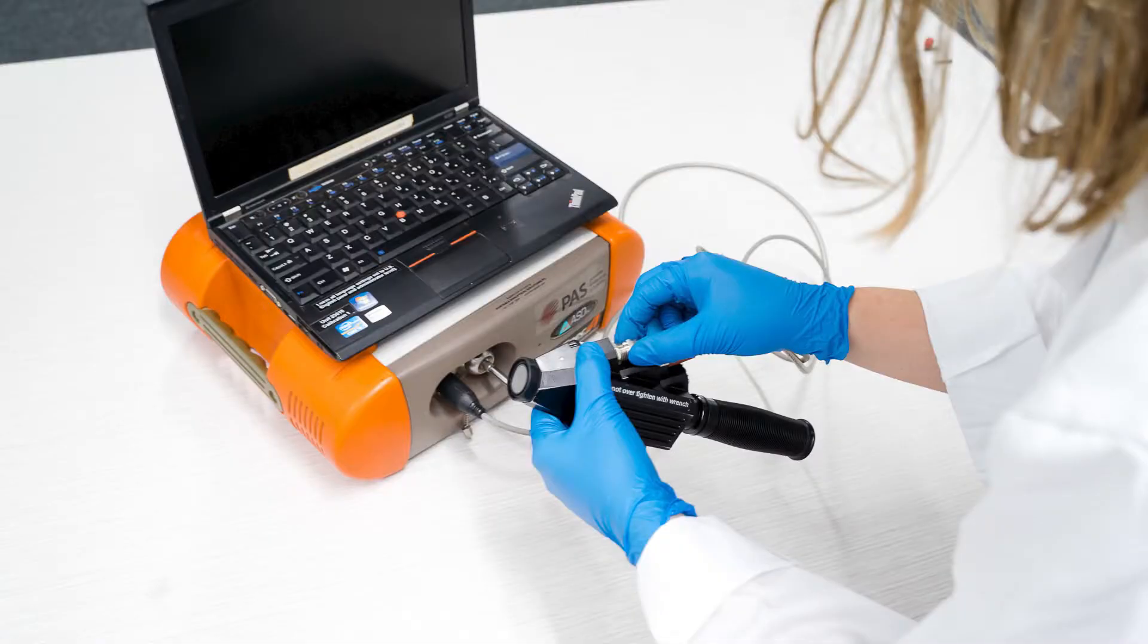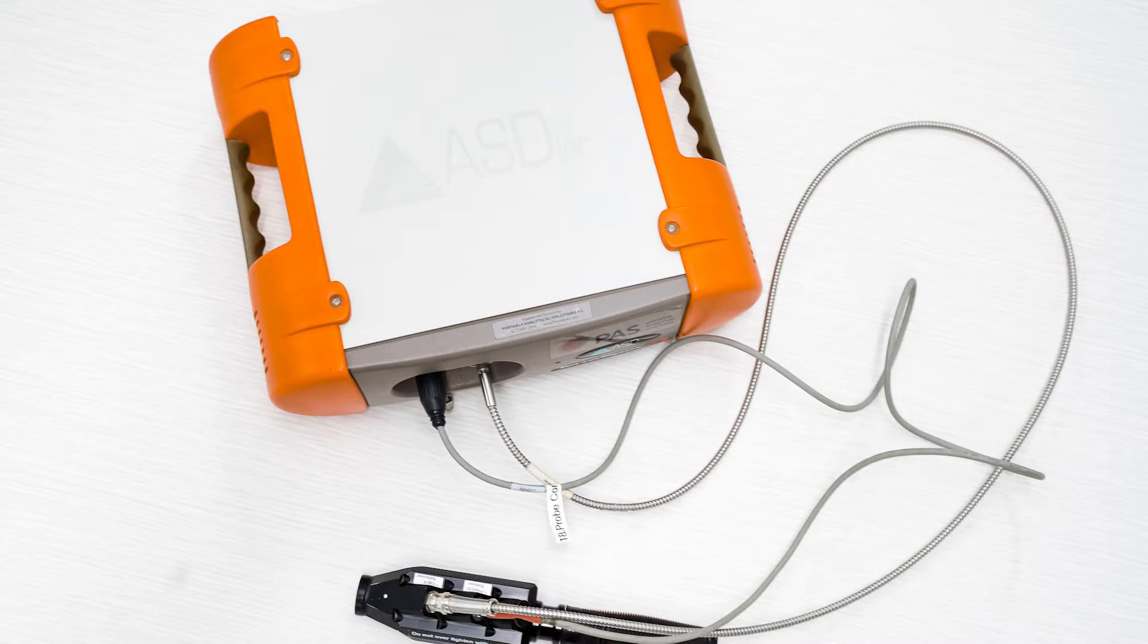Today we're going to be answering some of the frequently Googled questions about near-infrared and SWIR analysis. Here at Portable Spectral Services we have an ASD TerraSpec 4 that we use in-house as well as hiring it out to companies who want to do in-field analysis. Let's get started.